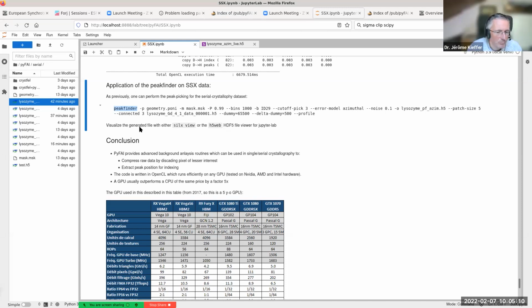So I apologize, because I knew it was going to be very technical, but this is also an advanced tutorial. You cannot do advanced science with simple things. Well, usually simple things have already been done.